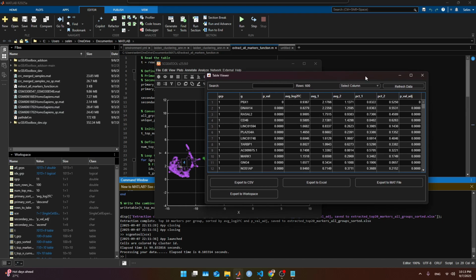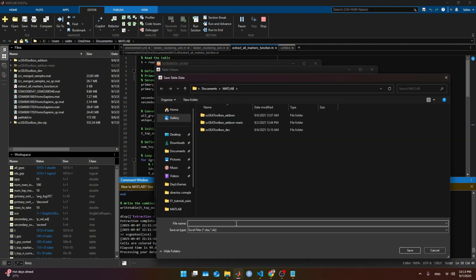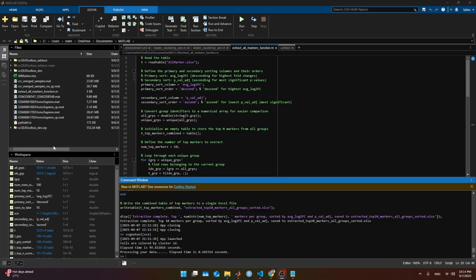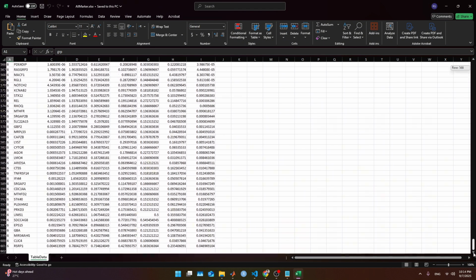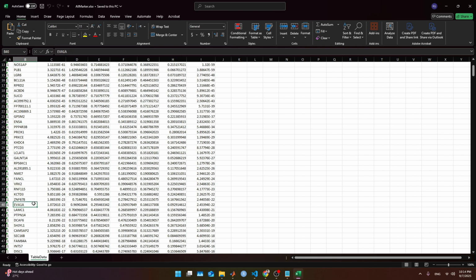Okie dokie. Once it's finished again, here we have the metadata. If I scroll down to the very bottom, it says 6. Great, that's what I wanted. Somehow I didn't overwrite the old marker I had before. So just be careful that you have what you need. This time I'm not gonna close this, and we're gonna go and look at that Excel. And perfect, it lights up to the 6th. And now I think it looks a little better in terms of markers.